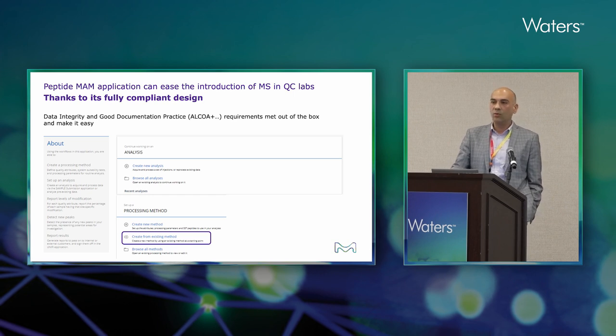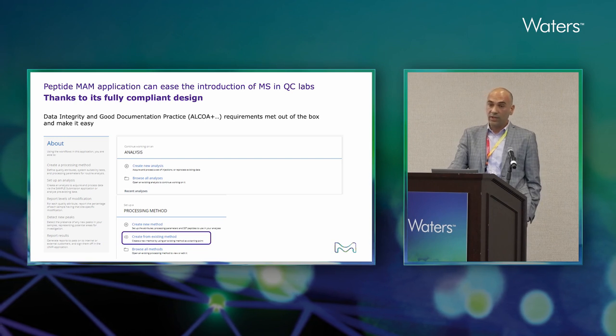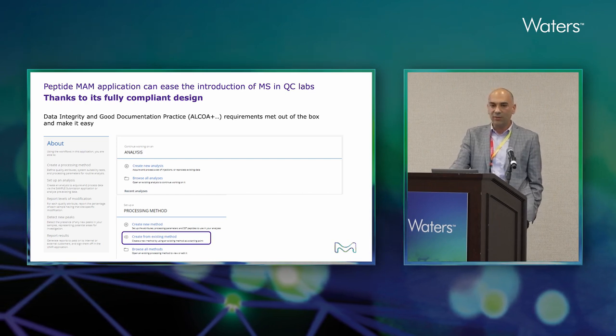What does it mean for those who have experience in QC? It means that every month when your QA asks to go through the log file of your GXP analysis, there will be no surprises, because nobody might by mistake modify the method.